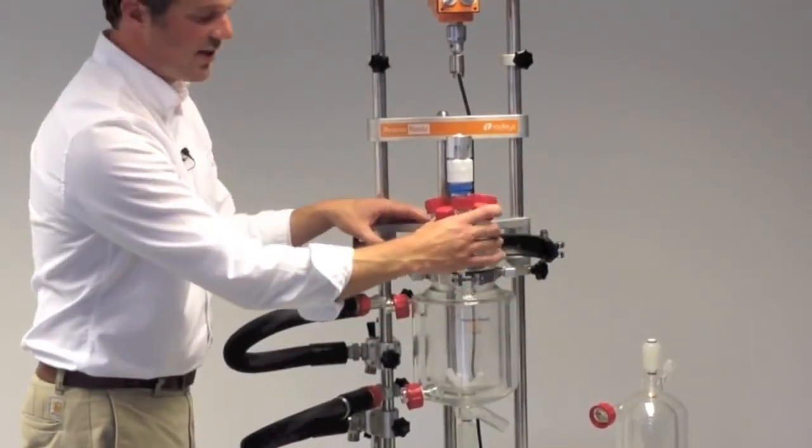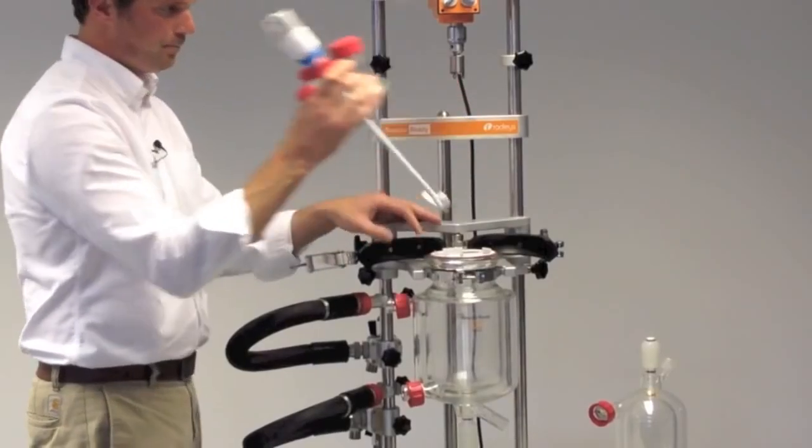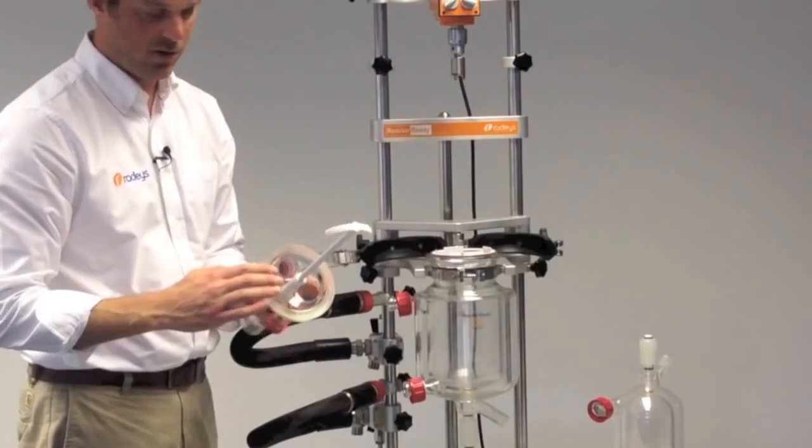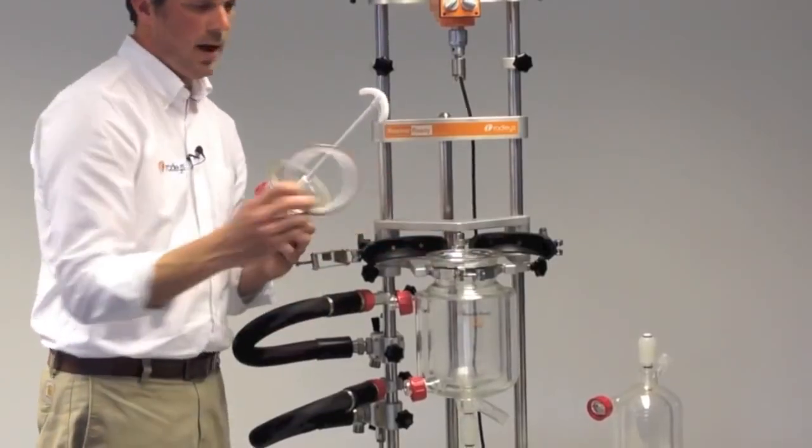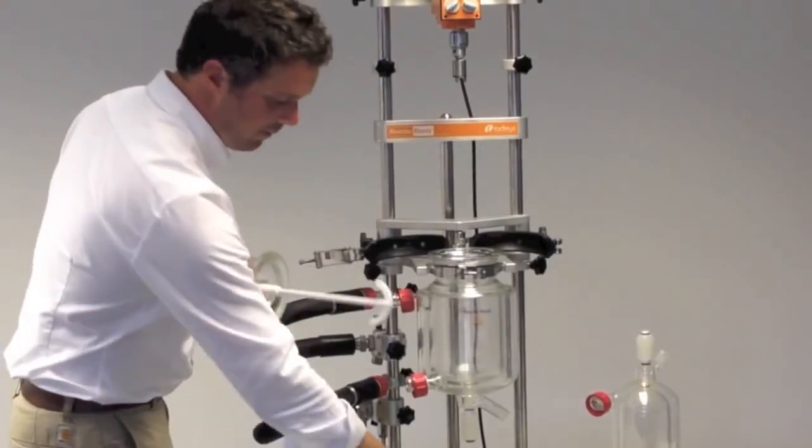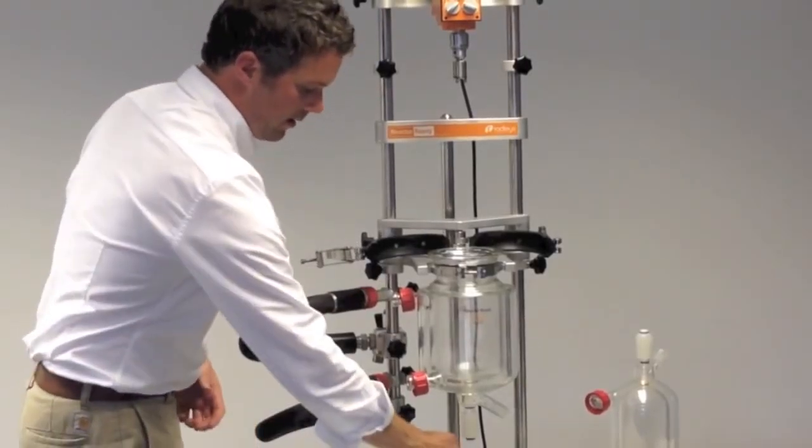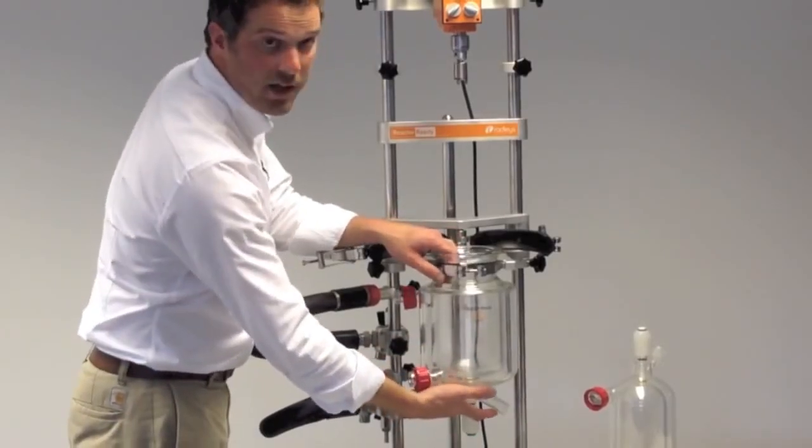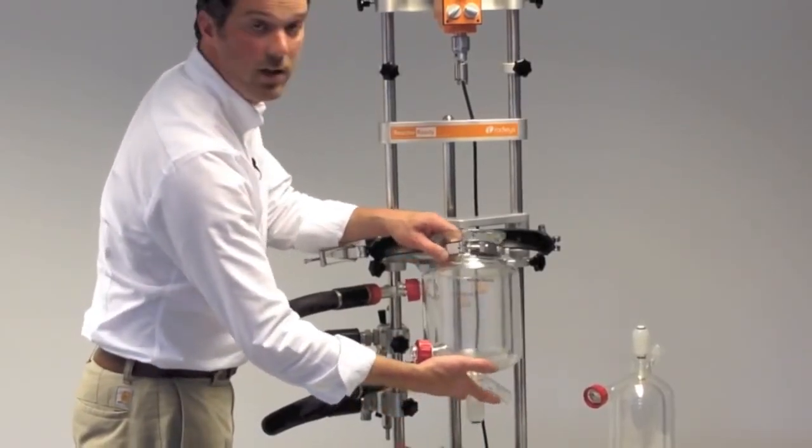All of the vessels share the same lid. You can see on the lid we have a flat flange on the lid, an FEP encapsulated o-ring with a PTFE support collar, and then a flat flange on top of the vessel. The combination of these offer a really good vacuum-tight seal.